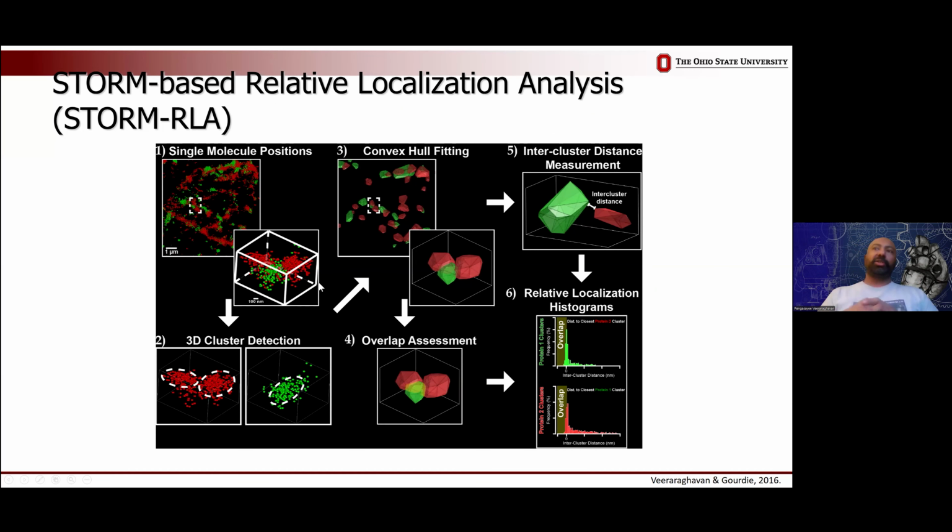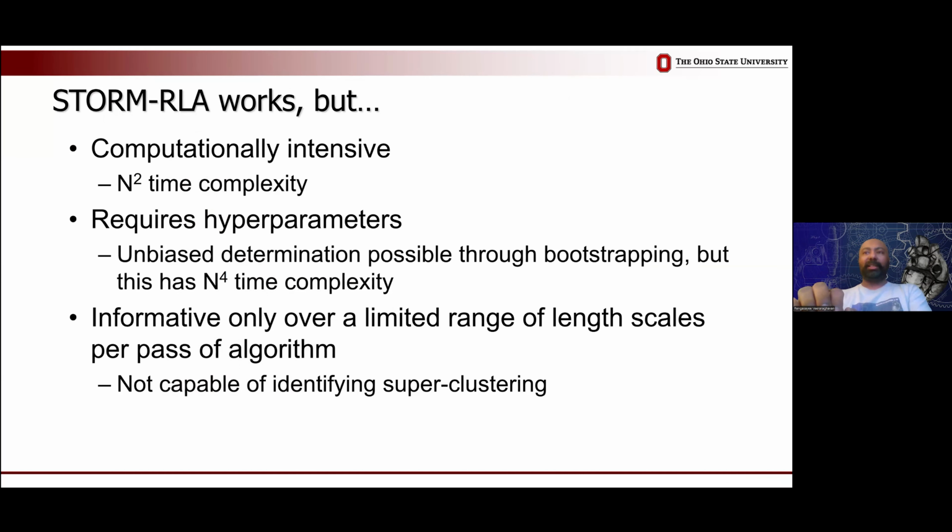Once we have these clusters, we can fit convex hulls around the clusters, and then we can play all kinds of games of looking at how often do these hulls overlap, what is their distance distribution, etc. I was perfectly happy with this method for a while, but there are always things in the margins poking at us, right? One of the problems with this method, well, it takes a long time to compute.